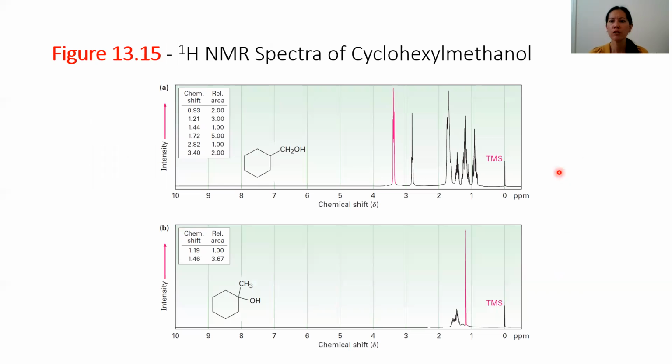Okay, so here are just 2 spectra that you can easily use to tell which product you get out. This anti-Markovnikov product has a methylene group, a CH, and the rest of the cyclohexane ring. You have a more complex spectrum, a lot of different types of non-equivalent H's, that will come up at different chemical shifts and also different splitting patterns.